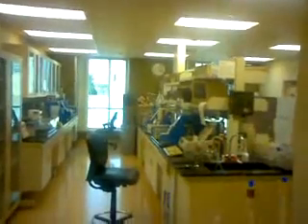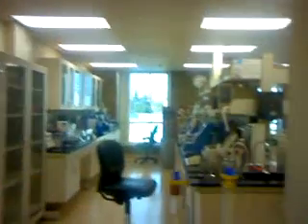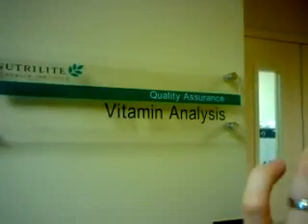Okay, this is my home or my lab. I test some of the vitamins here. And this area, she makes all the necessary items for testing for microbiology. So the different size bottles that you saw and all those things that are needed for microbiology are made here.